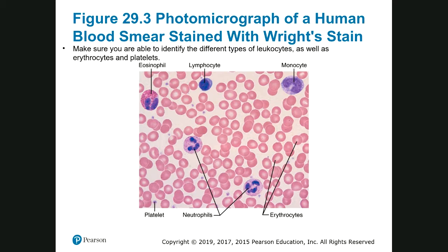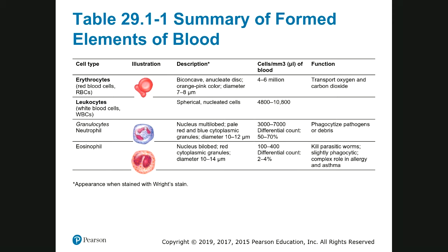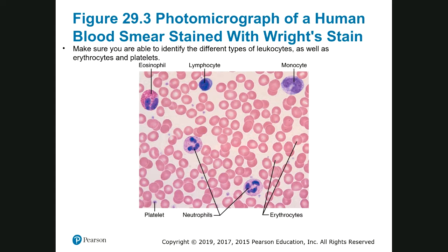You also see eosinophil. If you remember, eosinophil is bilobed. Look at how it looks, all right? Bilobed. So if we have exactly this form, this is eosinophil. It's bilobed, two lobes of the nucleus, okay? And the lymphocyte is the smallest white cell that is there, and it's smooth. There is no granulation. All of those have granulations. These have granulation. These two are smooth. They don't have granulation inside their cells.